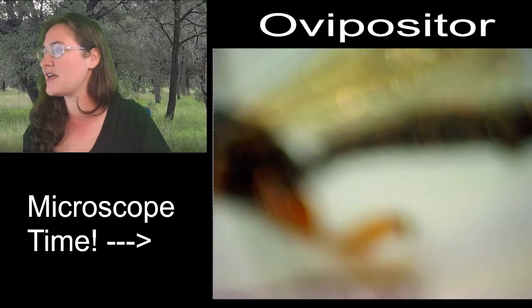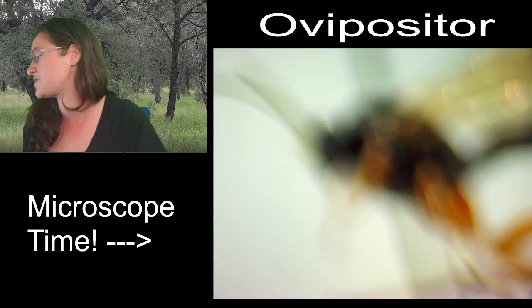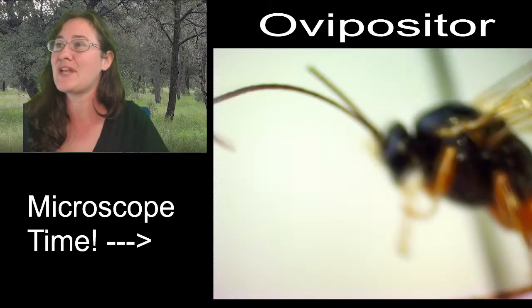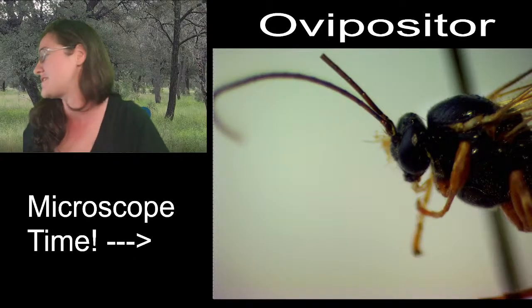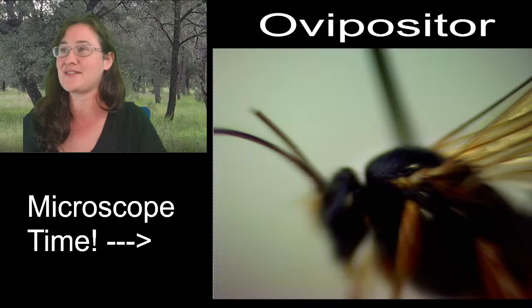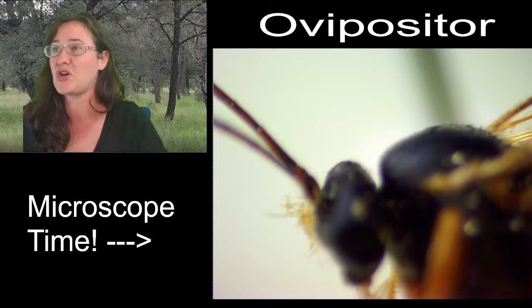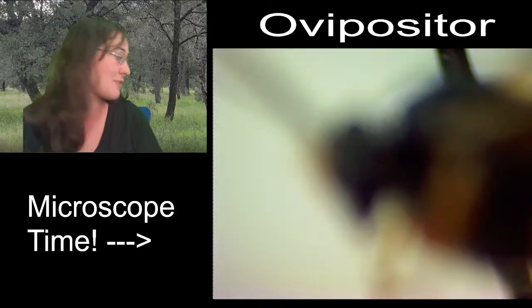Susan says that she missed the beginning. Did you say what this wasp specifically parasitizes? No, I did not, because I'm not sure what this wasp parasitizes. I would have to know what species it is to know what it was parasitizing, or I would have had to have collected it directly off of its host. And I believe this wasp just came to my light.